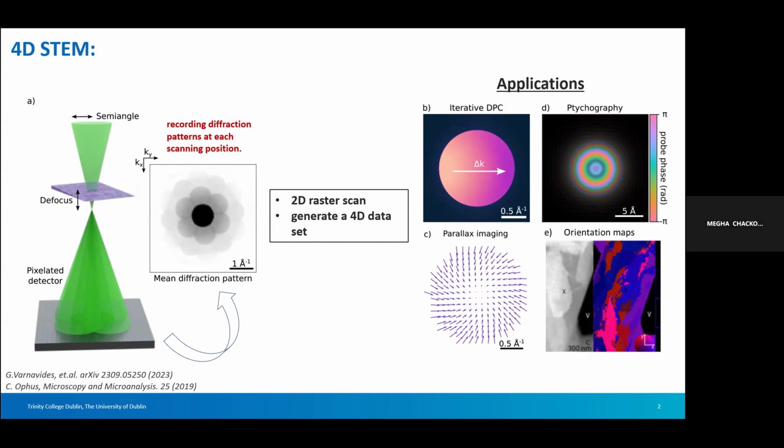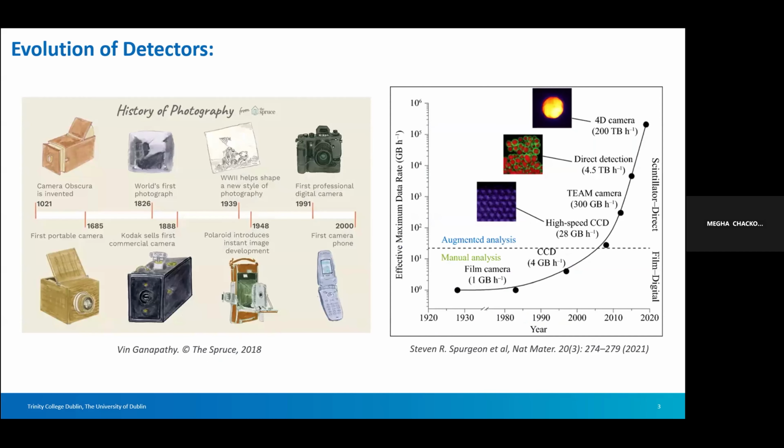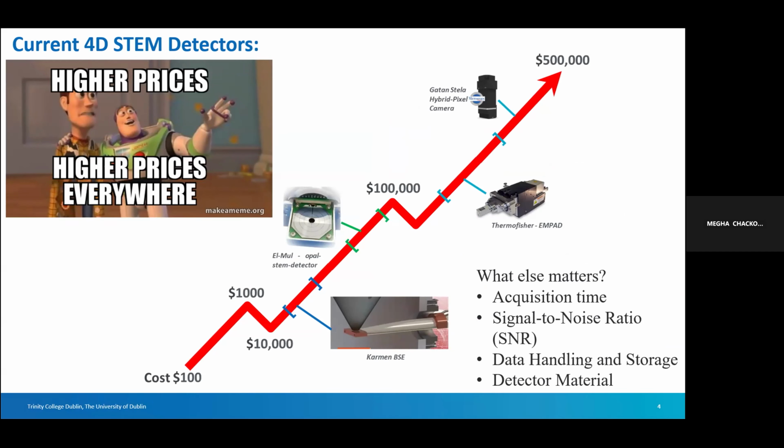Applications of this 4D STEM, such as DPC technologies or ptychography or orientation mapping, etc., which is helpful in the biological fields and material science field, make this technique most important in the electron microscope world. And let me take you to the history of these detectors. If you compare the detectors with a camera, I think most of you are familiar with cameras used like film-based cameras, CCD-based cameras, which we are using in mobiles. And the TEM cameras were also using photographic films in the past, and then they moved to CCD-based cameras, and now we are doing direct electron detection. So the 4D cameras which exist now are highly efficient, and they also give us high resolution, high signal to noise ratios. So why should I replace these cameras?